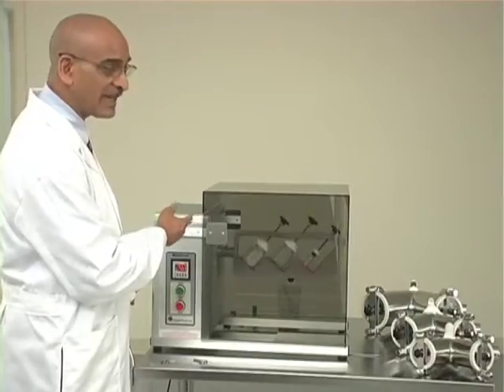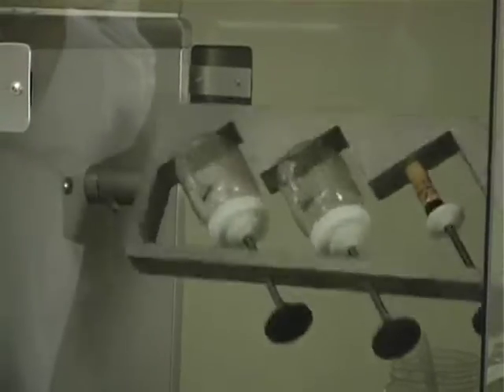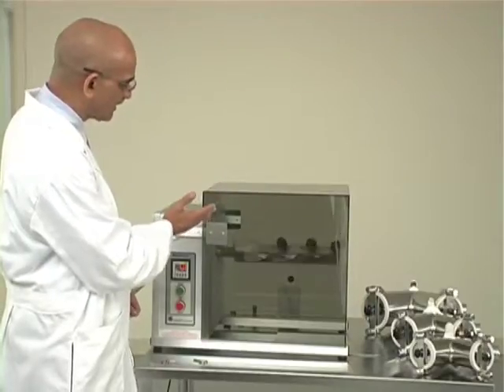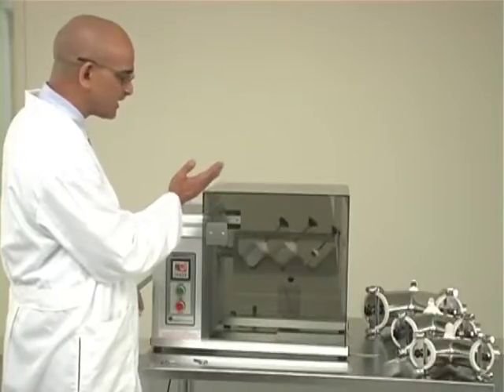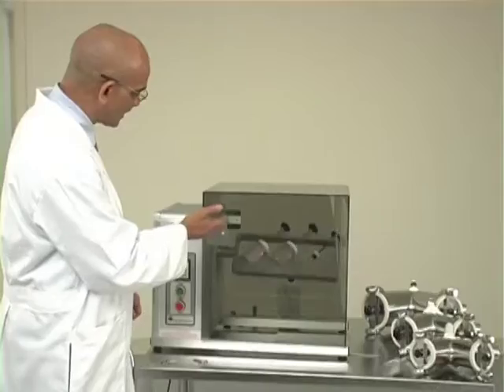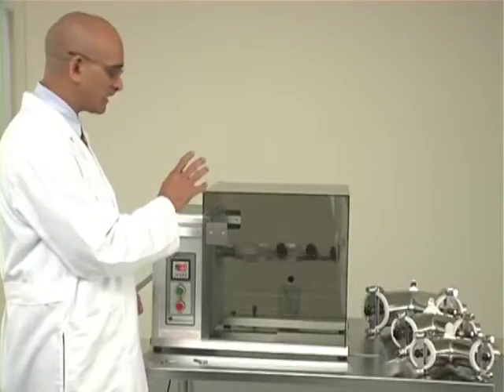As the bottle blending attachment is turning, you can see that each bottle mimics the motion of a V-shell because of the angle at which the bottle is situated on the bottle blending attachment. That angle is similar to the angle of a V-shell. You can also see how well it is already mixing in the bottle. We will show you after the 5-minute run how uniform the blend looks.